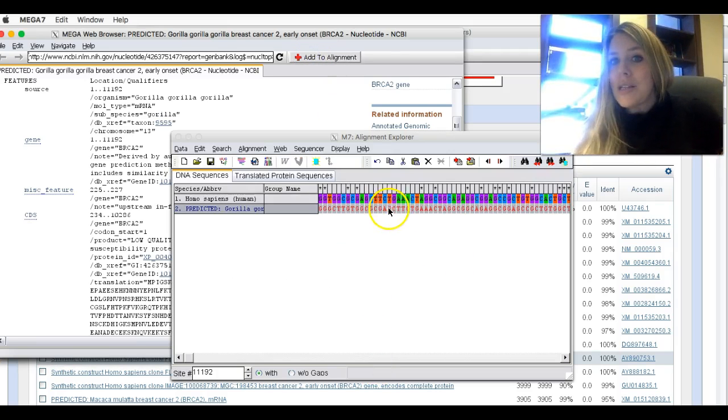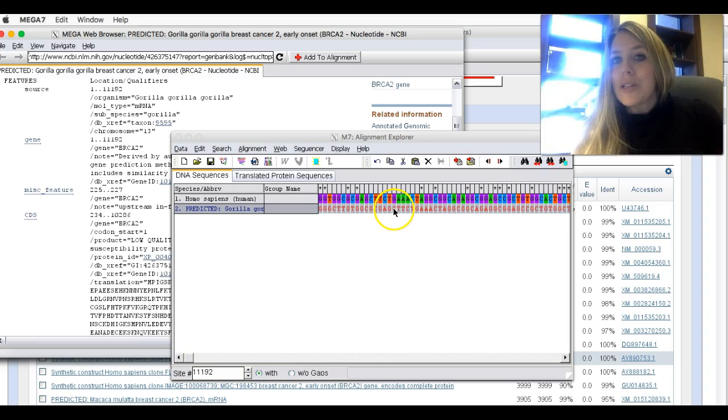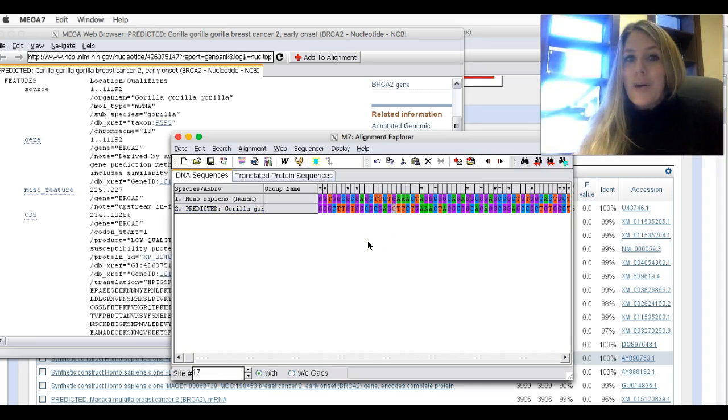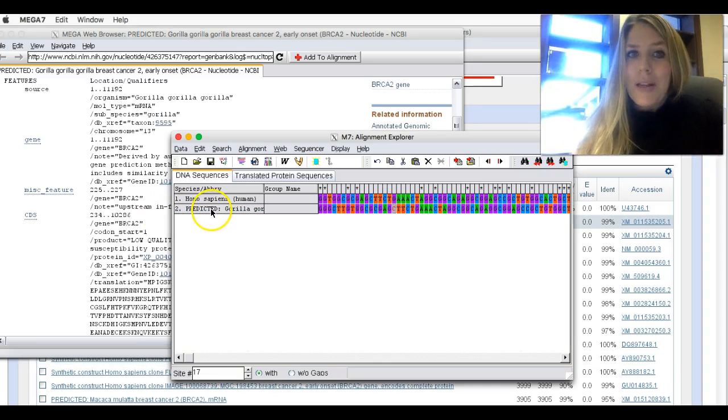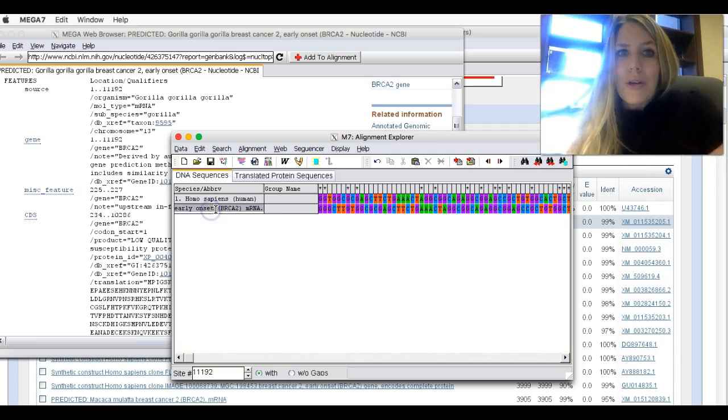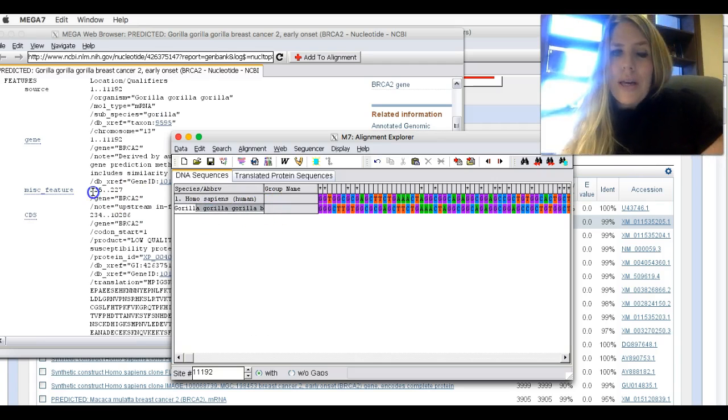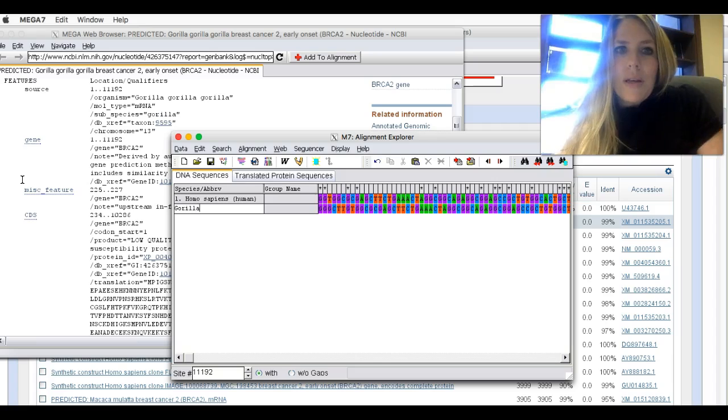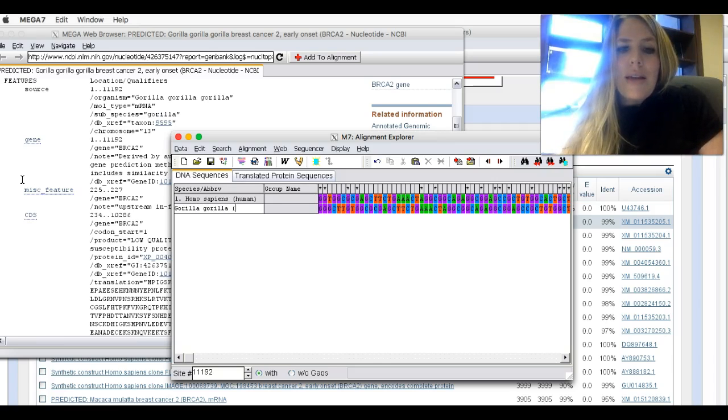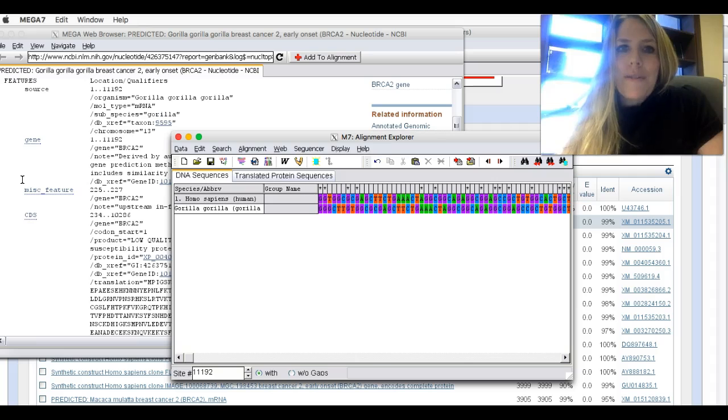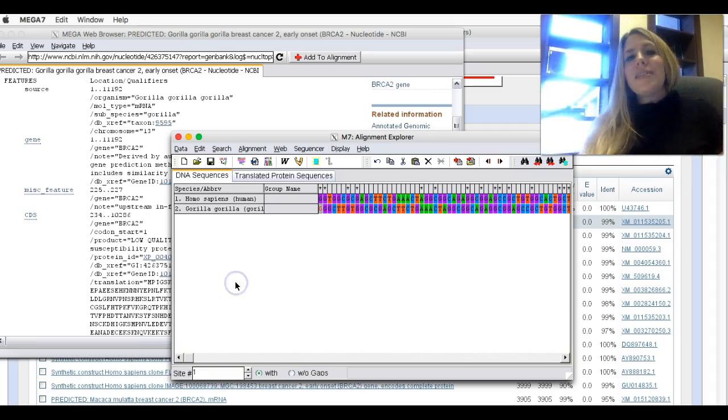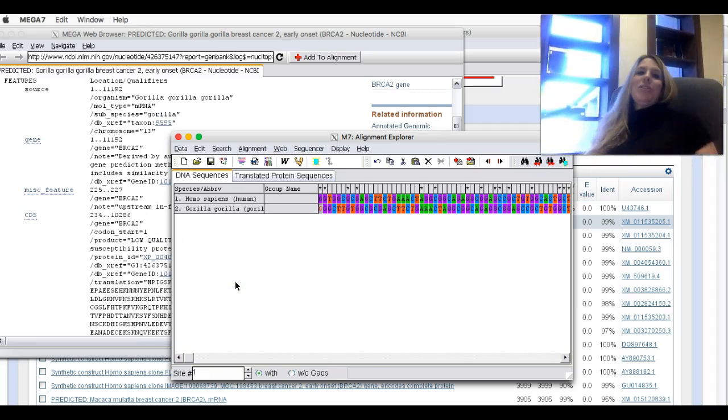Then I'm going to go up to the red cross sign, add to alignment. Hit OK. Notice it's not colored, so you can just click anywhere in that sequence to get the colors. So here is the gorilla. I'm going to go ahead, you don't have to, but I'm going to change this to gorilla gorilla. That's the species name of this guy. And in parentheses, I'm going to put gorilla. So there is my second species.